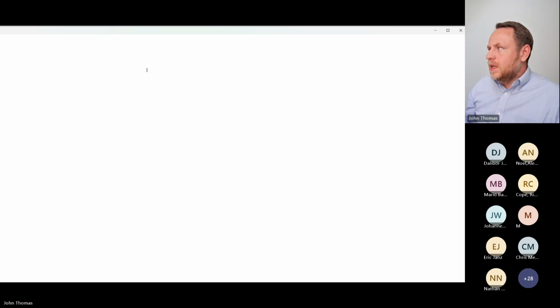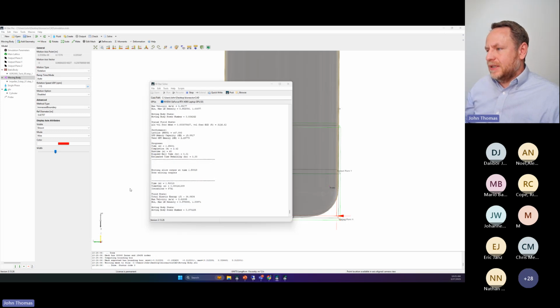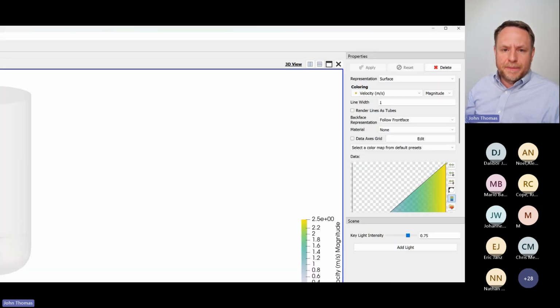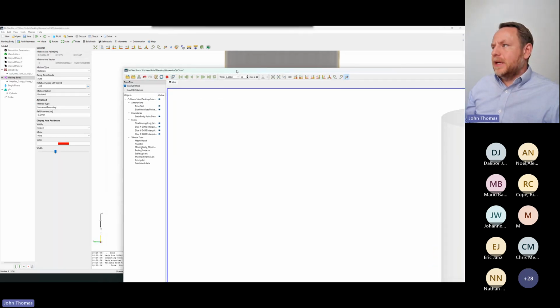watch this start to spin. So I'm running on two monitors, and so when I open M-Star Post, it doesn't know where to put it. So it just puts it up across both. I'll do my best to keep it just on the one monitor here. That should be casting. All right, come on, buddy. Let's see if you take.